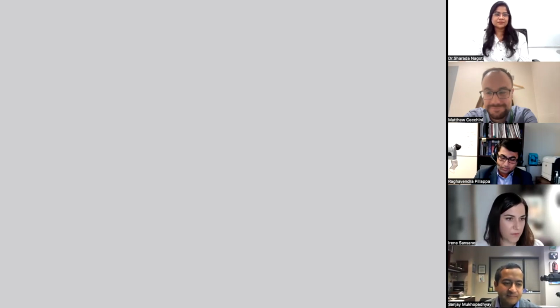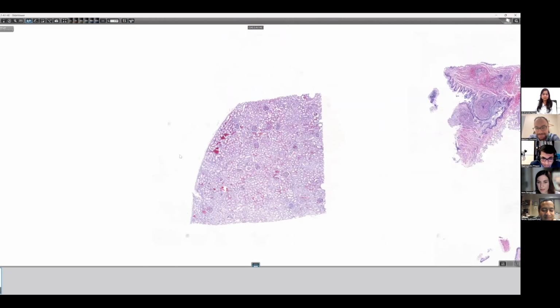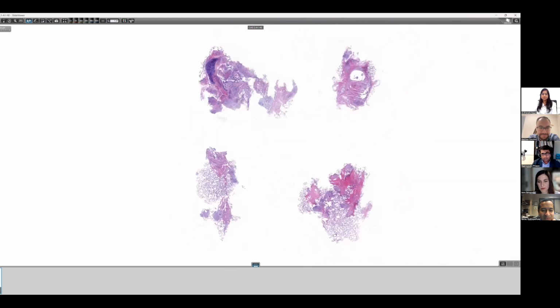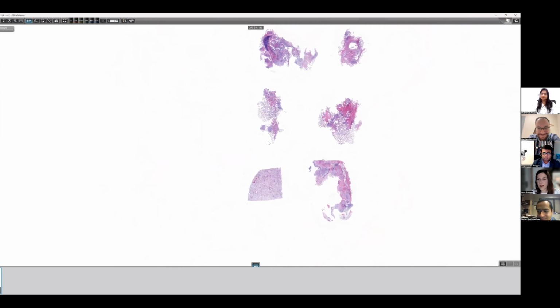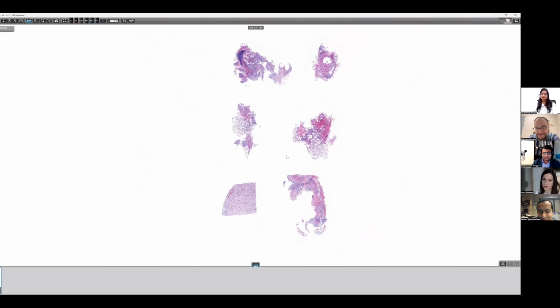Who wants to talk about this biopsy? Any volunteers, guys? I can take this one. Go ahead, Matt. So we place the different pieces of the cryobiopsy in a 6-hole cassette. We put kidney or liver in this space, and then we place piece number 1 here, piece number 2 here, and numbers 3, 4, and 5. That way you could say if there is an infarct or a nodule in a specific segment. The cryobiopsies are taken from the same lobe, but maybe from different segments.